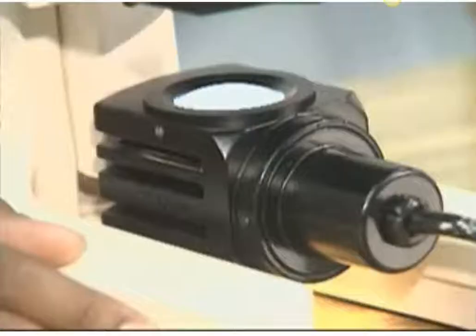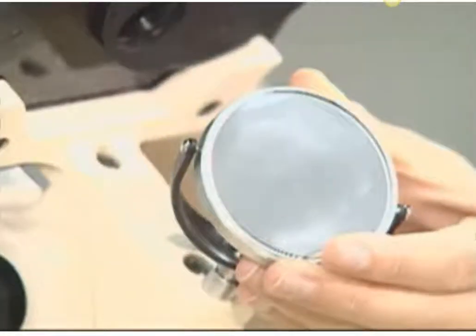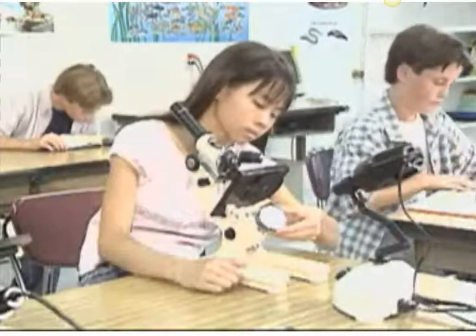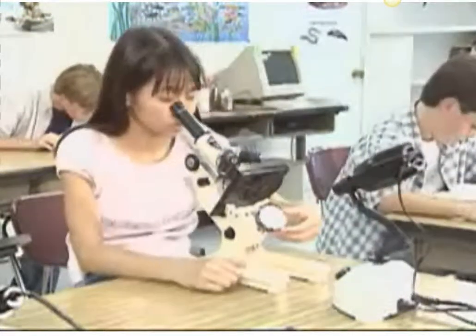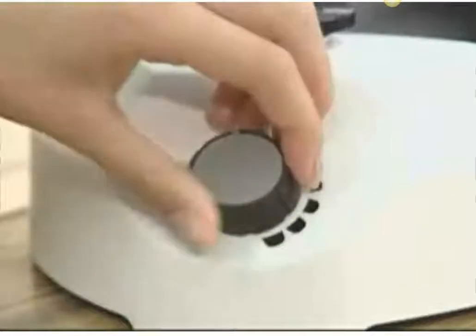The specimen is illuminated from below by either an illuminator or a mirror. The mirror should be angled toward a source of bright light, such as a lamp or a window, or as in this case, an illuminator. Mirrors should never be angled directly at the sun. Many illuminators have a knob that controls the brightness.